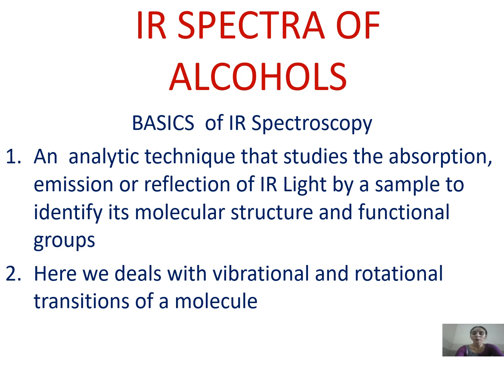IR spectroscopy is an analytic technique that studies the absorption, emission, or reflection of IR light by a sample to identify its molecular structure and functional groups. In IR spectroscopy, we deal with vibrational and rotational transitions of a molecule, and for a molecule to be IR active, there must be a change in dipole moment.